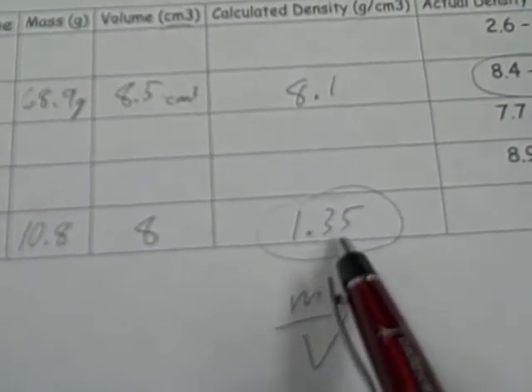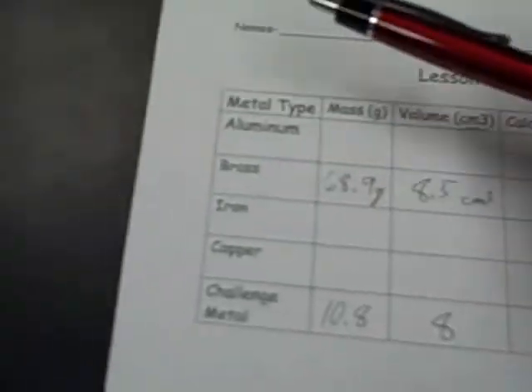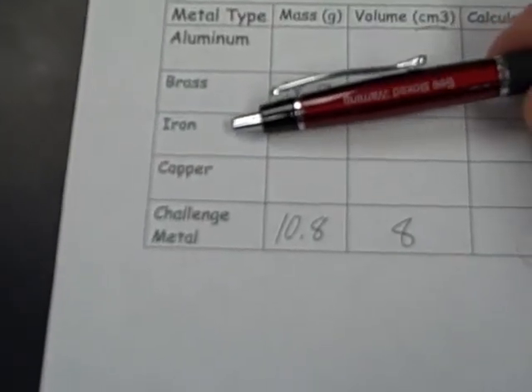And that is how you go about calculating the density. So in the lab today, you're to use aluminum, brass, iron, and copper.